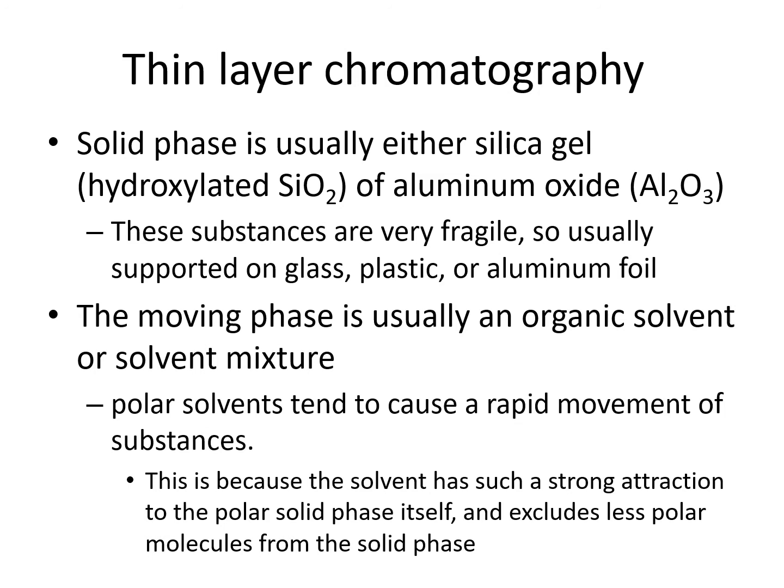Whereas here, the solid phase in thin layer chromatography is mostly a powder, either silica or alumina. To make this powder planar, we have to support it with other inert materials like glass, plastic, and aluminum foil. So these powders will cover the entire aluminum foil or plastic sheet, so that the separation will be easy.